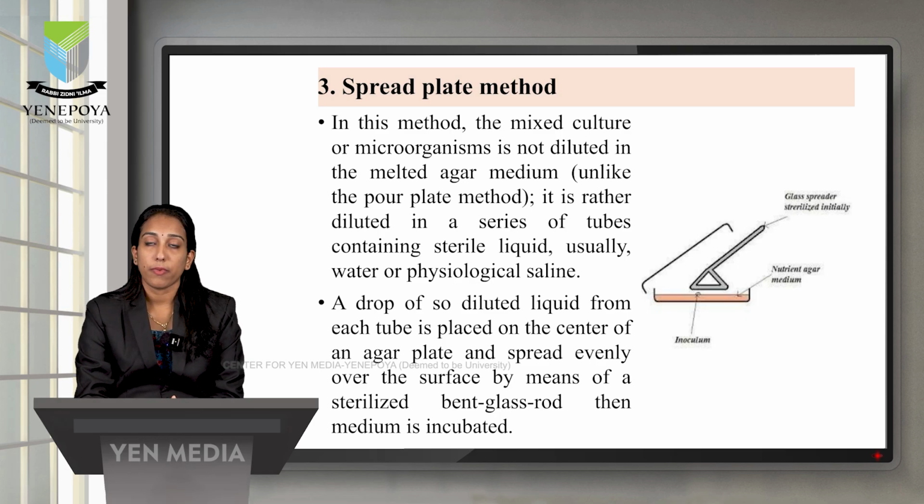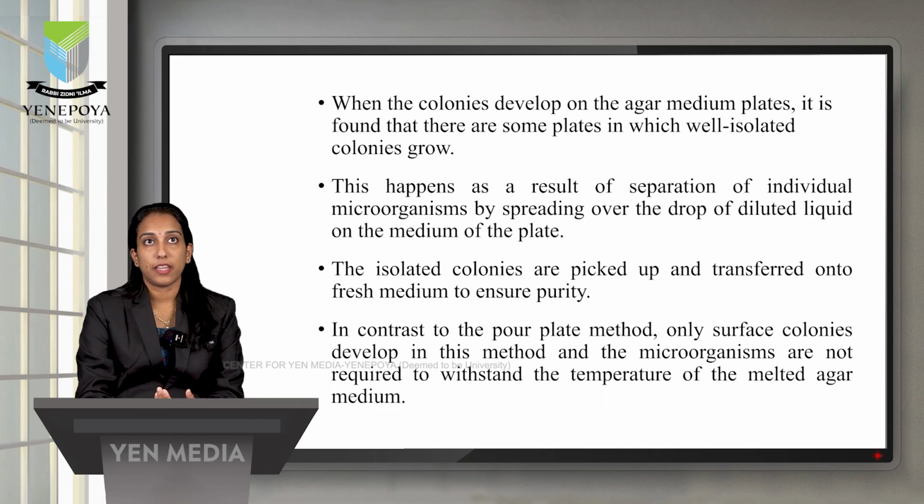bent glass rod, one bent glass rod as in the figure here. We will be using a bent glass rod, and this bent glass rod will help to spread out the inoculum which we kept on the Petri plate. That is about the spread plate method.